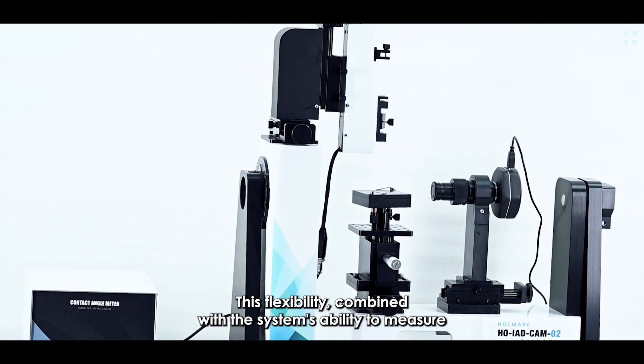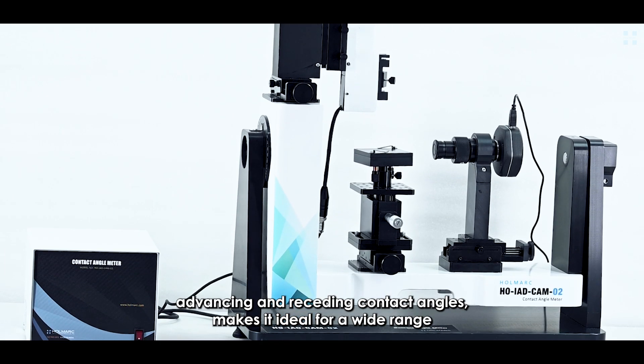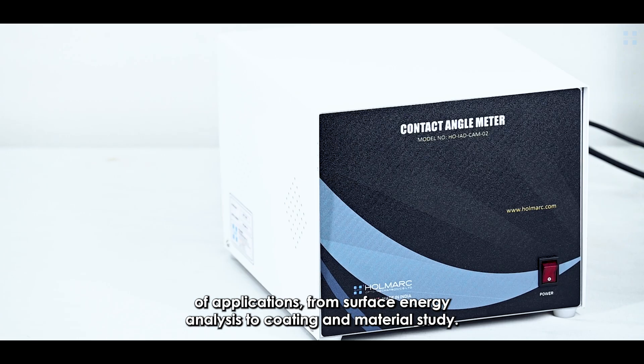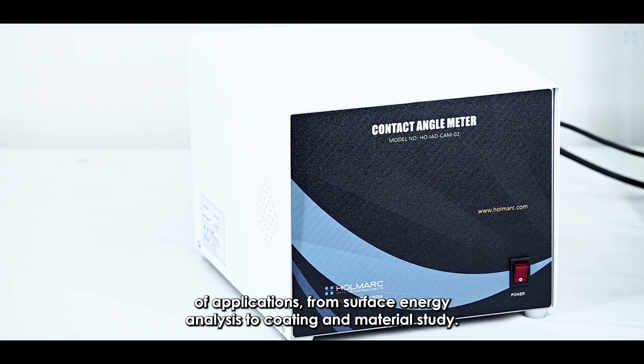This flexibility, combined with the system's ability to measure advancing and receding contact angles, makes it ideal for a wide range of applications, from surface energy analysis to coating and material study.